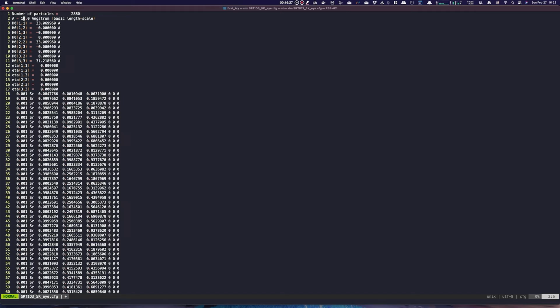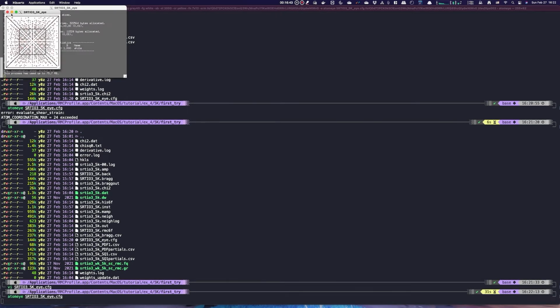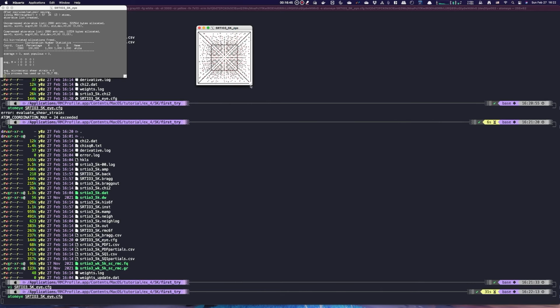So that's definitely not right. For visualization purposes, we don't need that value to be accurate, so we just want to change it to something bigger than 1, like 10 in this case, and let's see whether that will work. So you see that it does work.